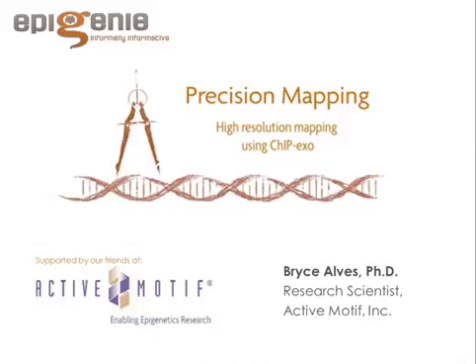I didn't go into that depth of detail here in the talk. Right. Great. So what sequencing platforms is the Active Motif kit compatible with? The Active Motif kit is made to work with Illumina. The adapters are all designed to work on the Illumina platform under ChIP-Seq.